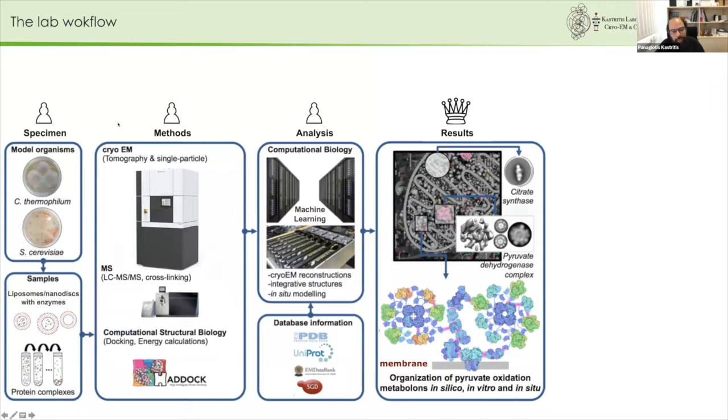And then we are doing our methods like with our in-house Glacios microscope. With collaborators, we are doing mass spectrometry to get proteomic data and also computational structural biology methods we have in the lab. Since, as Shoshana said, I did my PhD developing the software Haddock in Alexandre Bonvin's group.